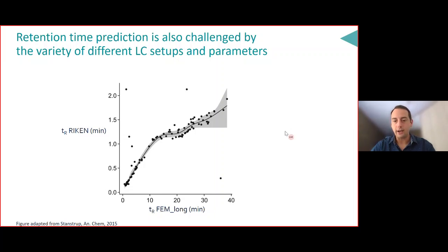And as of now, nobody has been able to predict an accurate retention time if you have this input data and you have to predict for that kind of output. And so that has been very difficult. And the result is that retention time prediction has not been used very dramatically because it's difficult to adapt somebody's predictions to your own workflow. In proteomics, it works better because we tend to all use C18 and the same kind of gradients. But in metabolomics, this has been a serious issue.